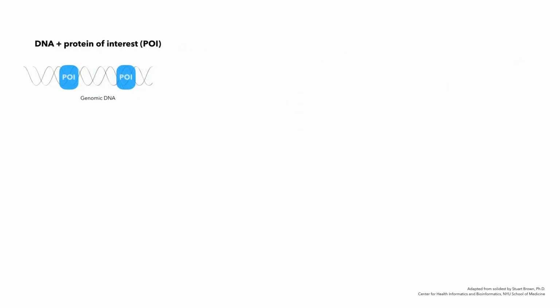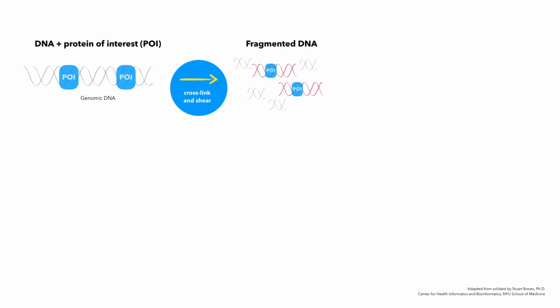The whole process of data preparation looks like this. Proteins of interest, like histones, are bound to DNA. DNA is fragmented, resulting in DNA fragments that have protein of interest on them and others that do not. They might have other proteins on them or nothing at all. Only DNA with proteins of interest bound to them are of interest. They are selected with specially designed antibodies.